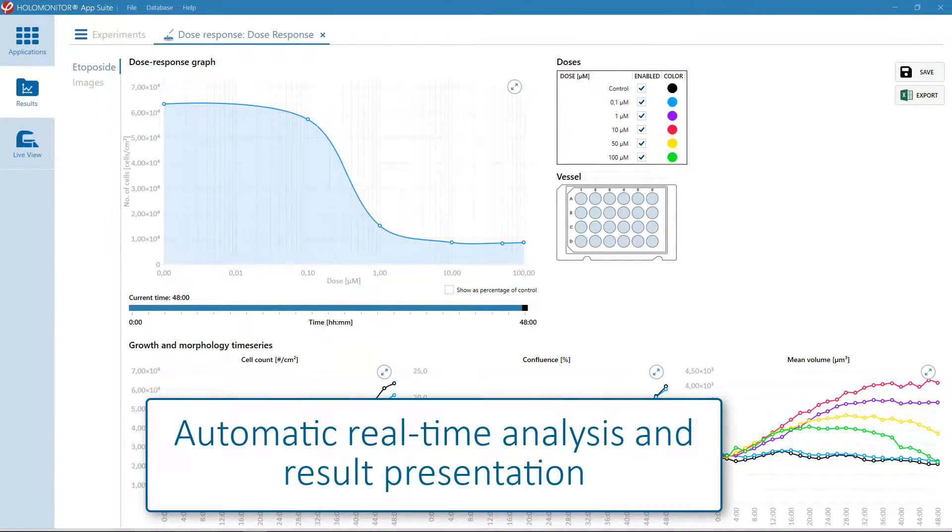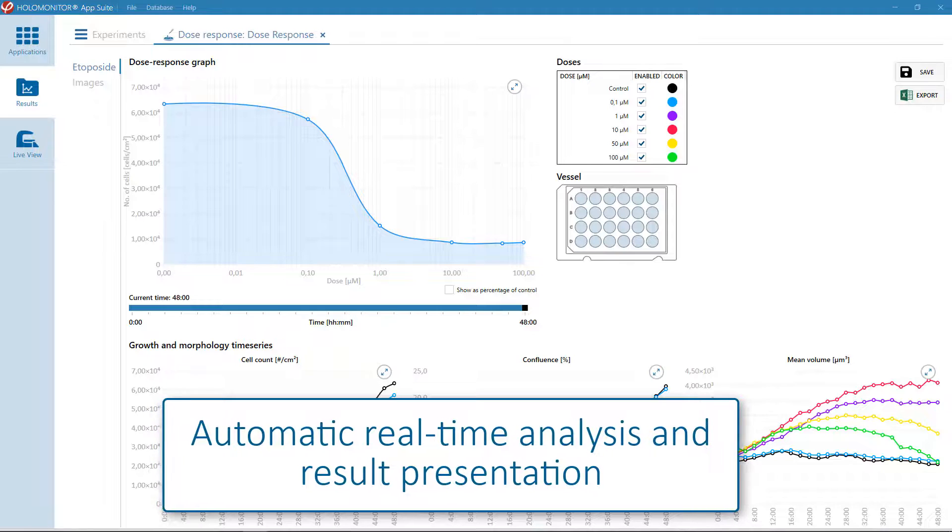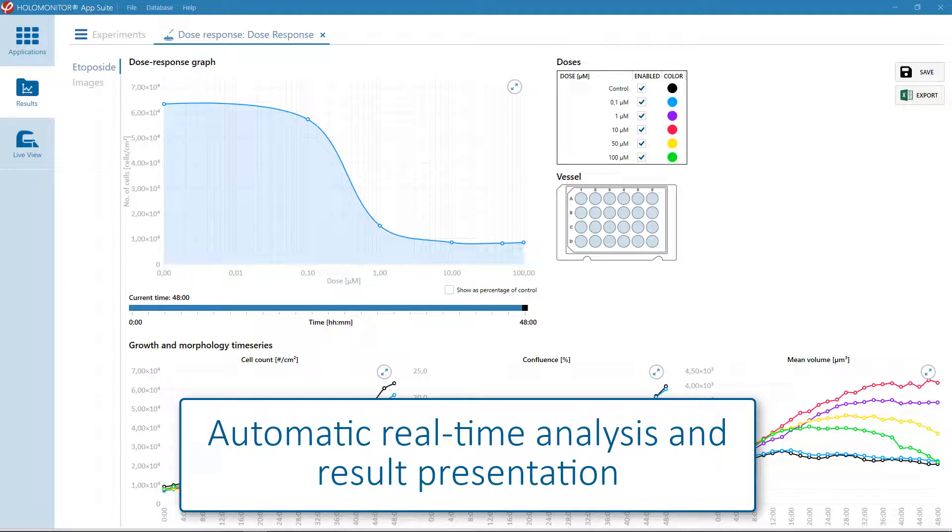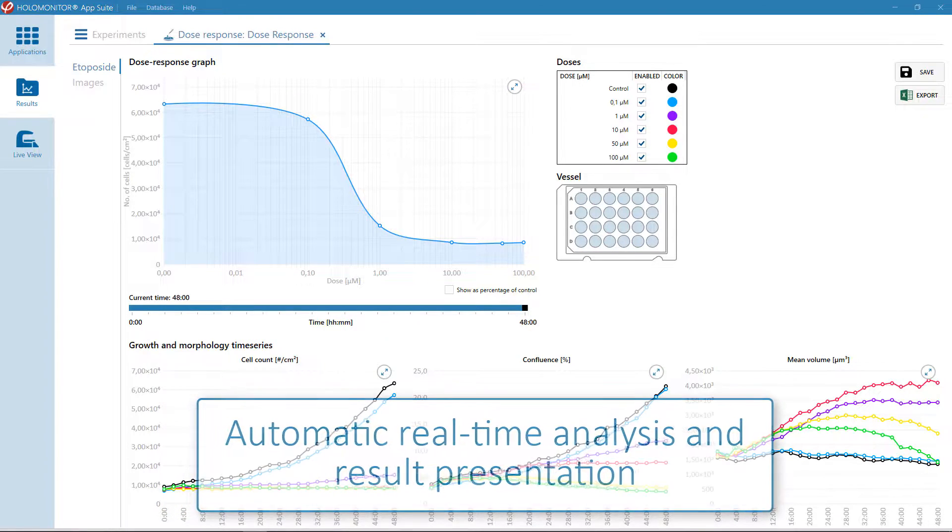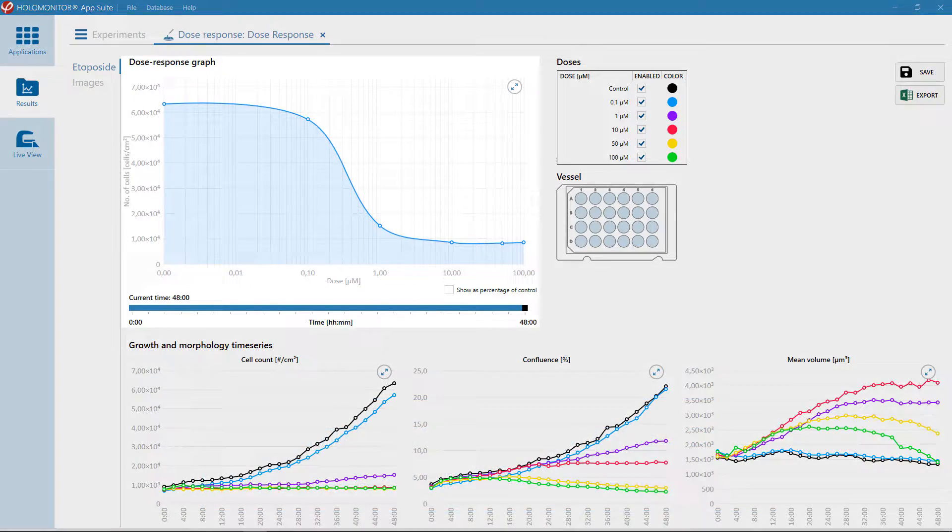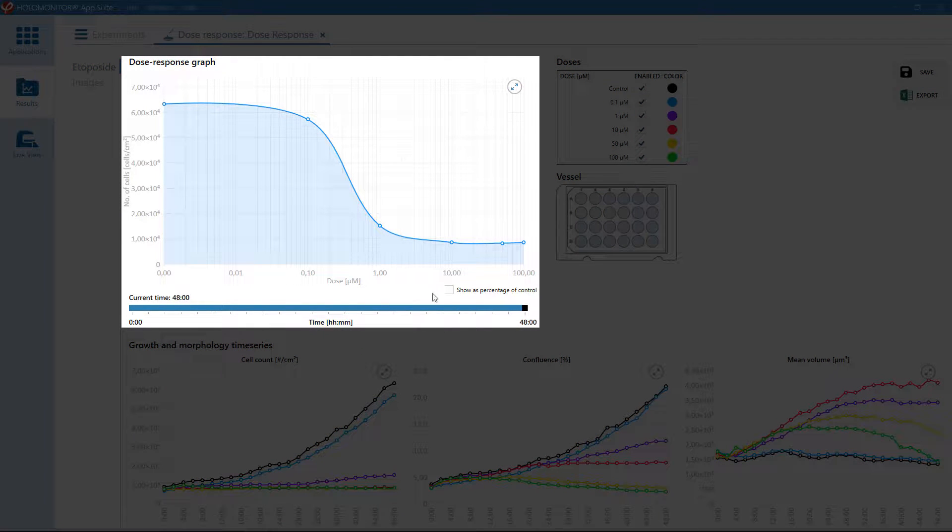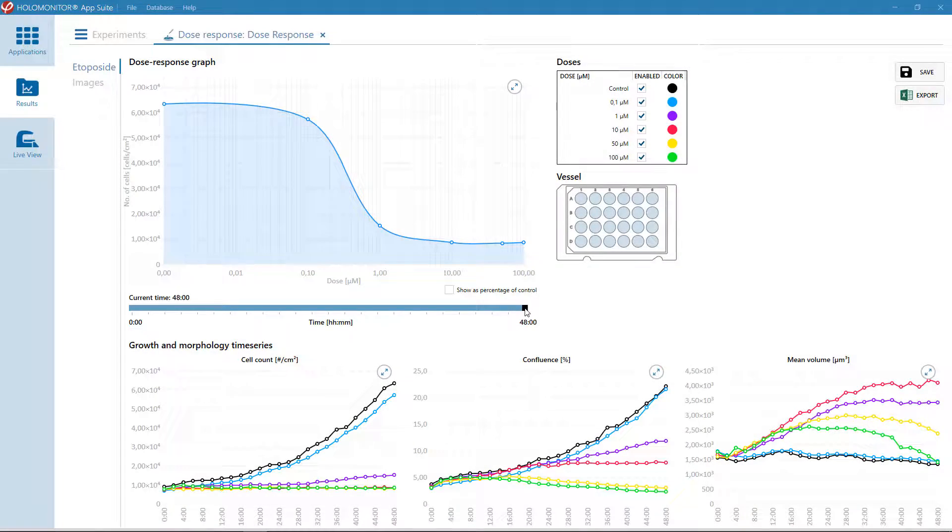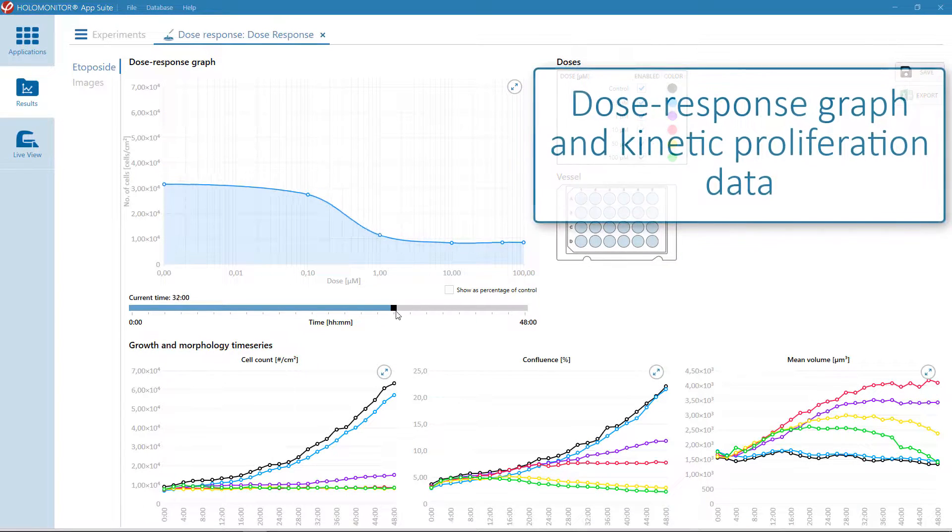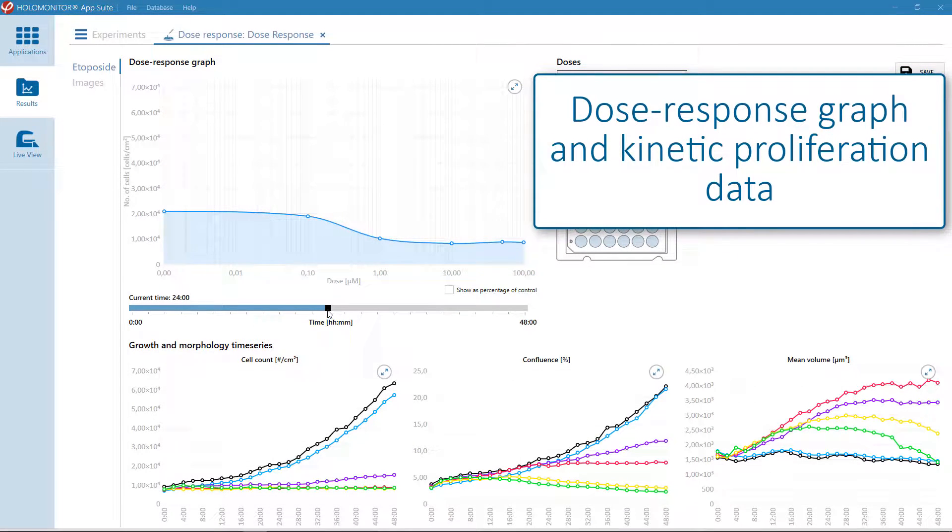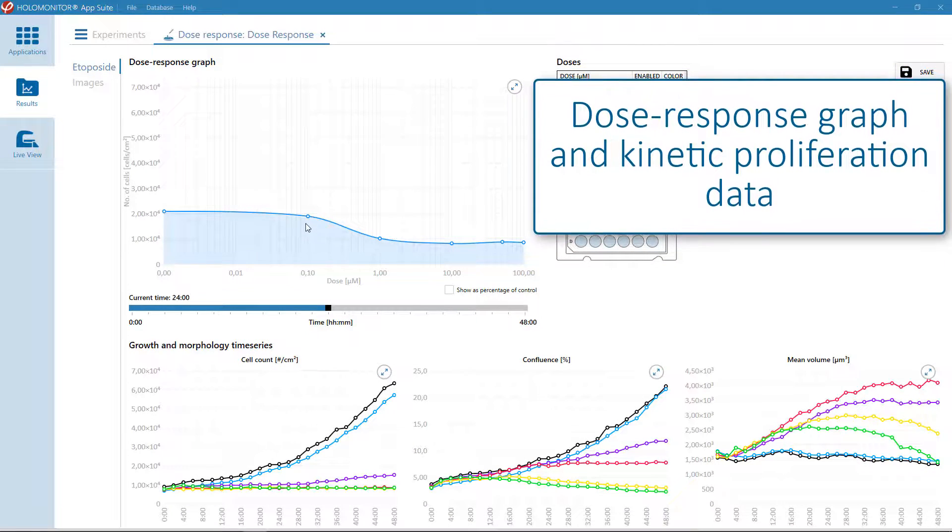The analysis is done automatically and the results can be viewed in real time. Like here, where you can see those response graphs from any selected time point.